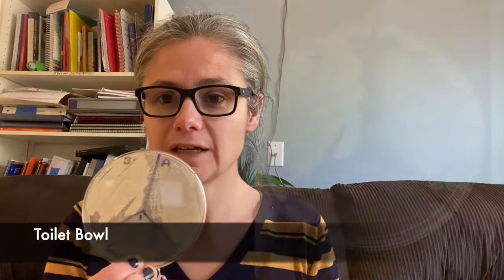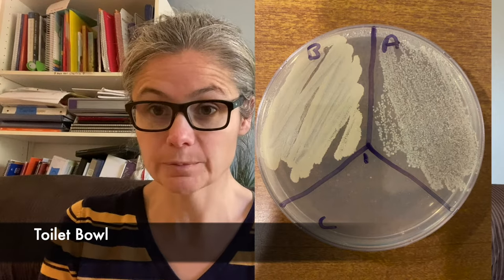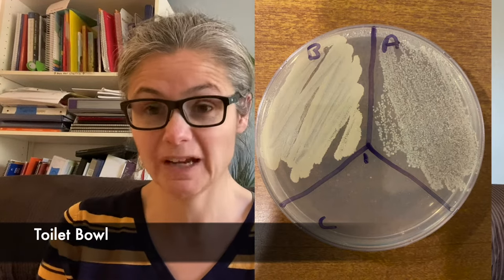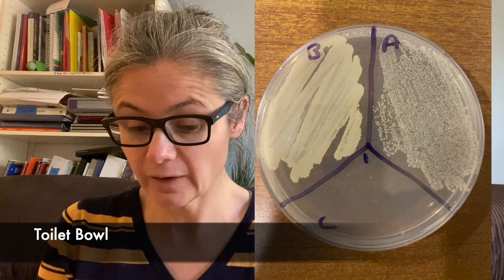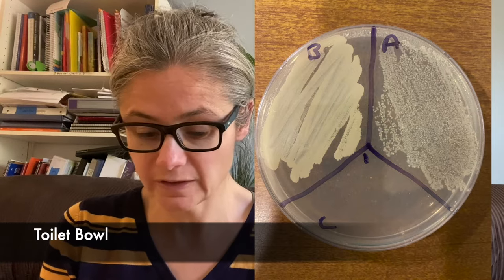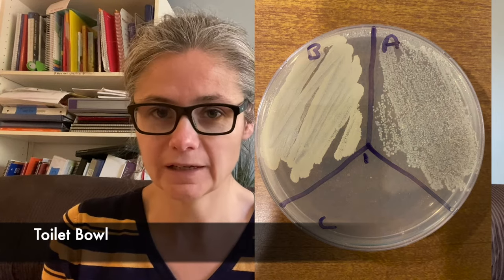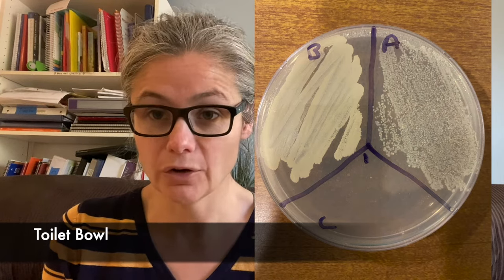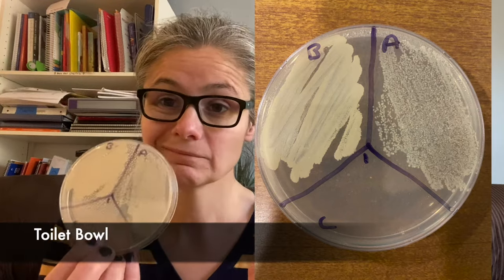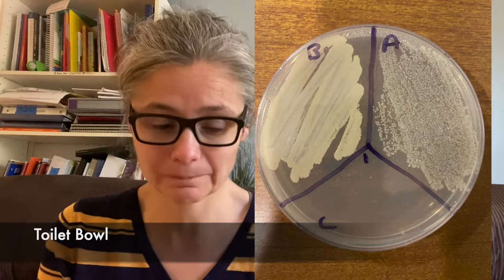The toilet bowl. As you can see, you have a picture there, so I'll hold it this way so I can see. B was before, and you can see there's plenty of bacteria in B. Now in the A section, after we disinfected with the Pinesol, there's definitely less bacteria, but there's still quite a bit. Would I say it killed 99.9% of germs? No. Not super impressed with its ability to clean and disinfect a toilet.